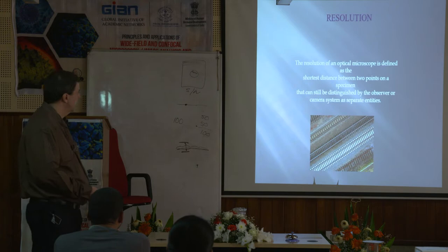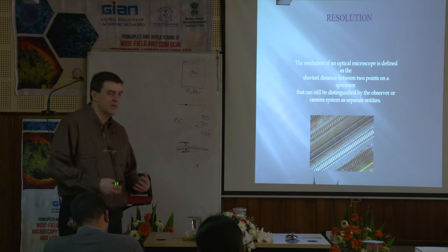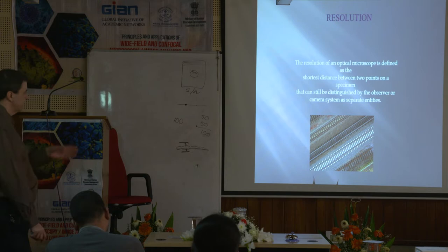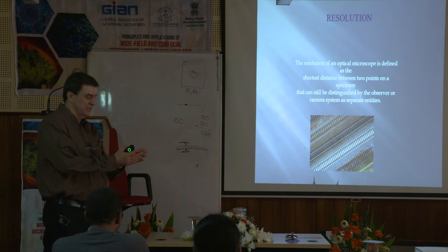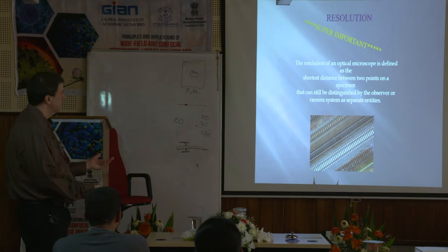Okay, again, my favorite thing we've been talking about, the idea of resolution. It's all about resolution, because what is everything? NA is everything. It just comes back to this again and again. You have to be able to tell two different things apart for anything to work. I gave the example today of the railroad tracks seen from outer space. It would look like one line, but eventually when you get the resolving power, you would see the two tracks. It's very important. That's why I've mentioned it so many times.